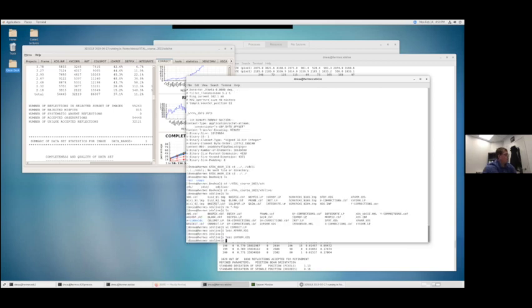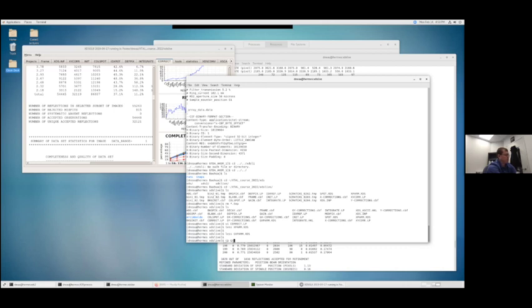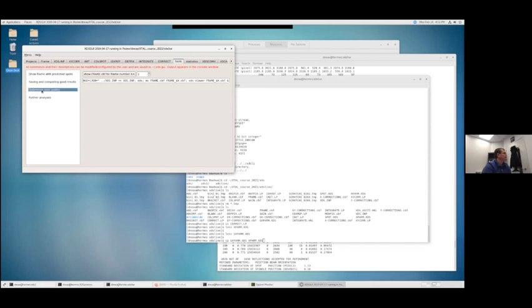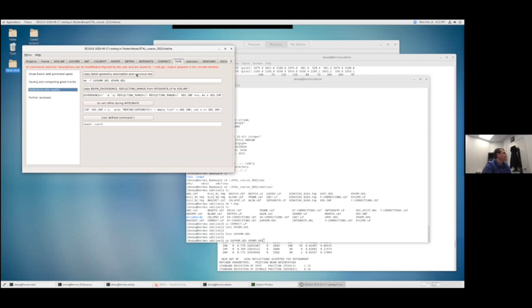So one of the things you can do is copy gxparm.xds over the xparm.xds and then rerun integrate and correct. And what that does is just update some of those values that were refined, right? And in fact, in XDS GUI, there's a tool here, optimizing data quality. And it's just copy latest geometry description over the previous one. In this case, they actually use the command move, but it copies the gxparm over to xparm.xds.